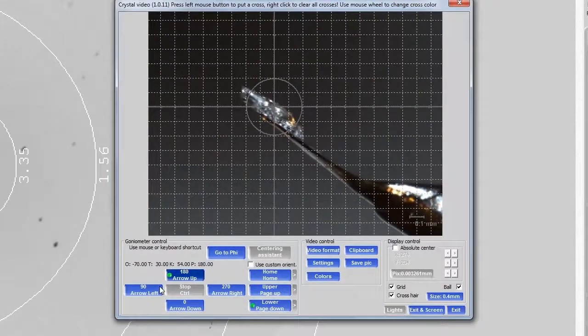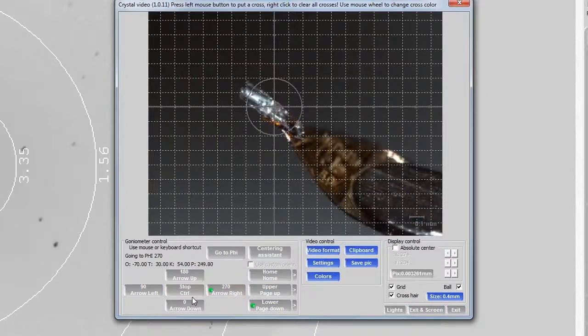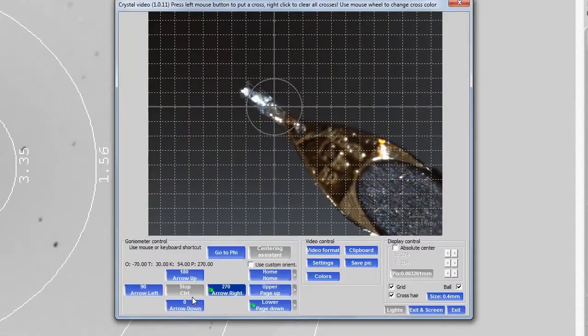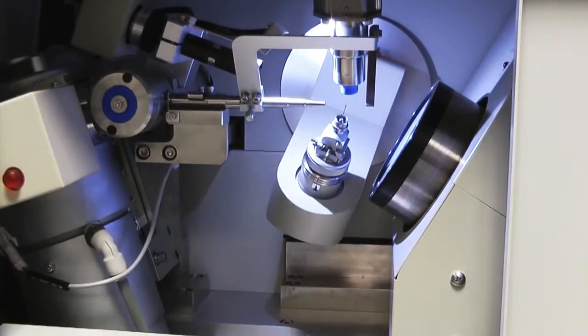If you are not using phi in the unlocked mode, you can instead use control buttons on the software to rotate the crystal by 90 degrees. Lock phi and close the door. Don't forget to press the door lock button.